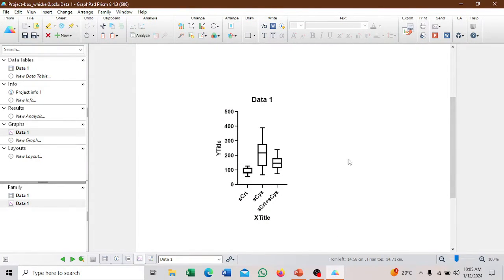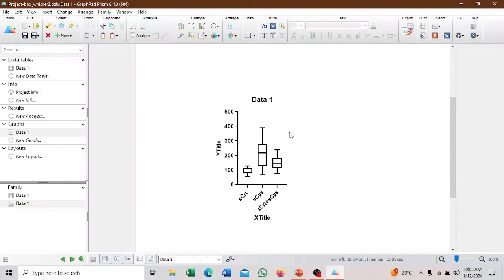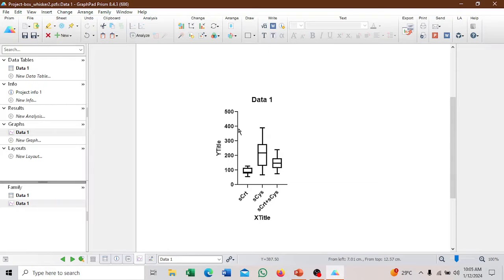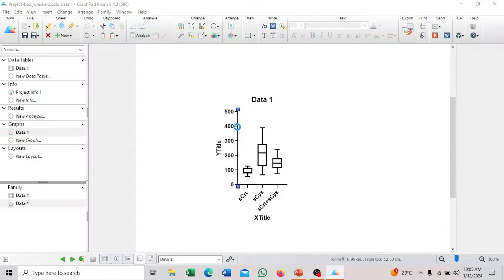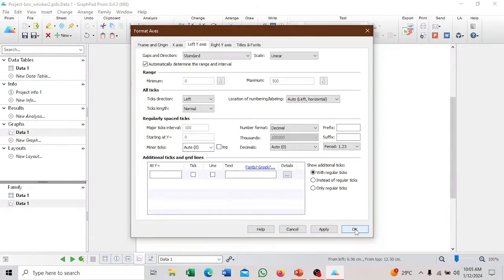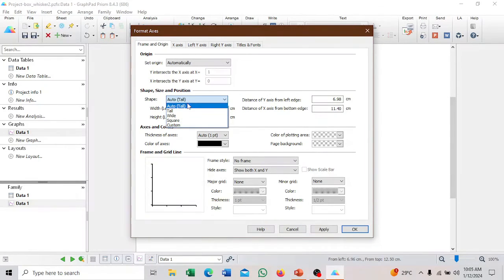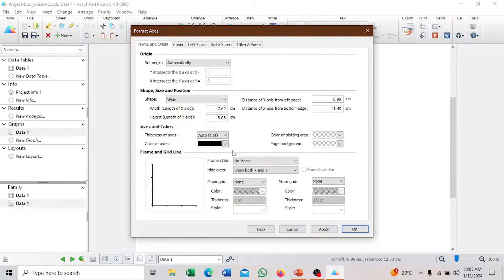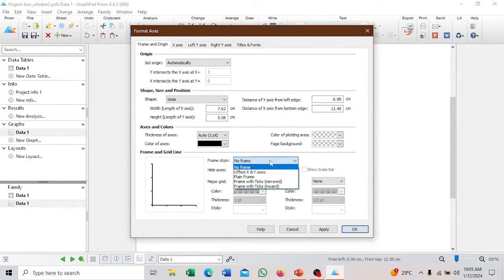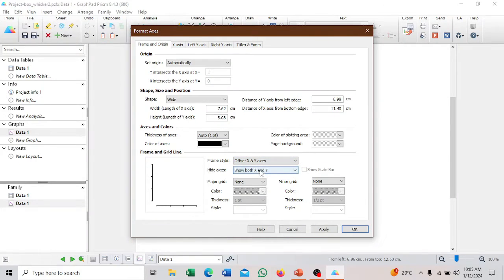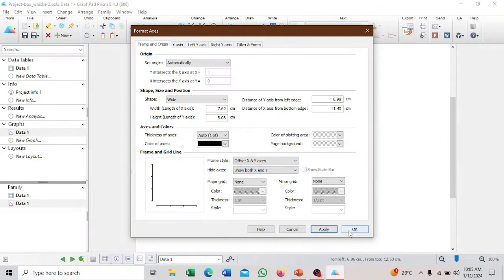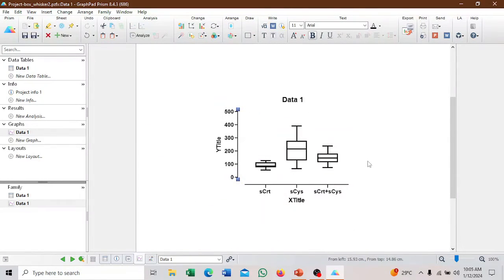This is what we have, but you can see that it's very small and only tall. We want a wider figure. We'll double click on this. This is the formatting window. We'll go to frame and origin, and then here is shape. We want it to be wide, not tall, so we choose wide. We want to also offset the X from the Y axis. Then we'll apply.